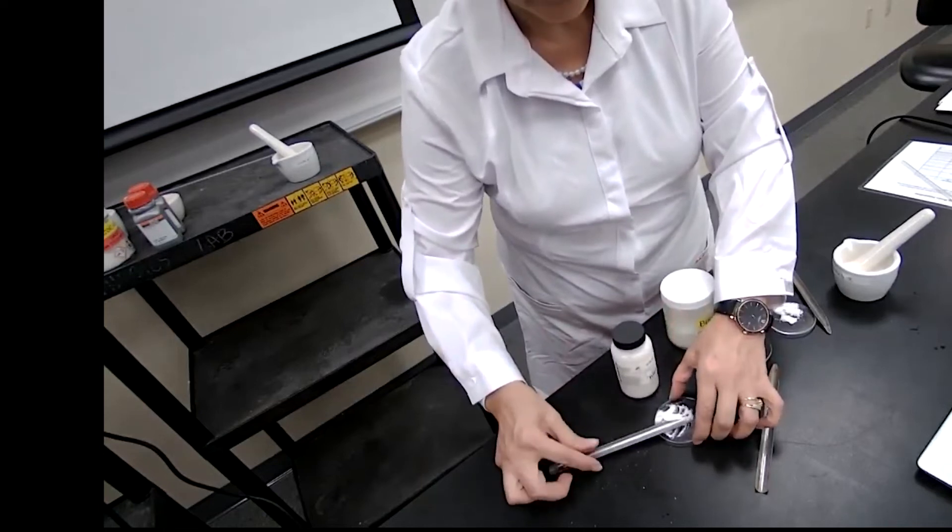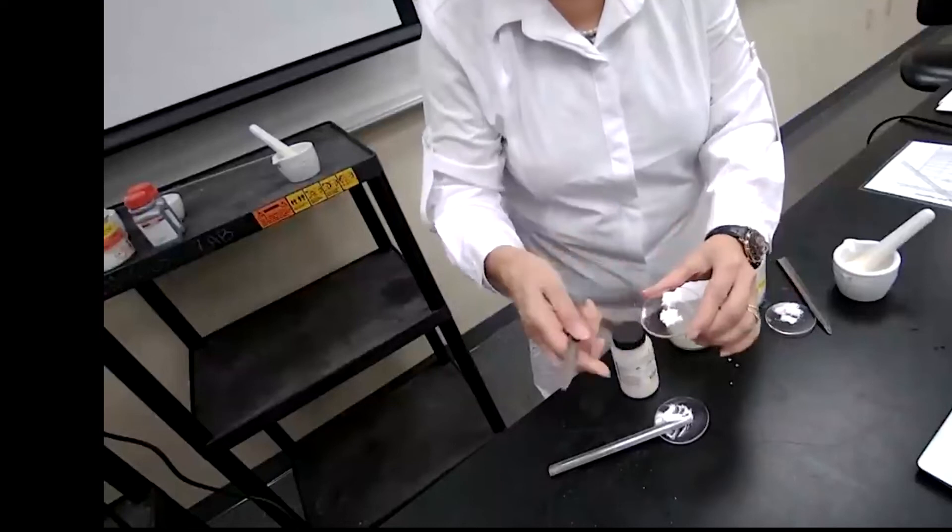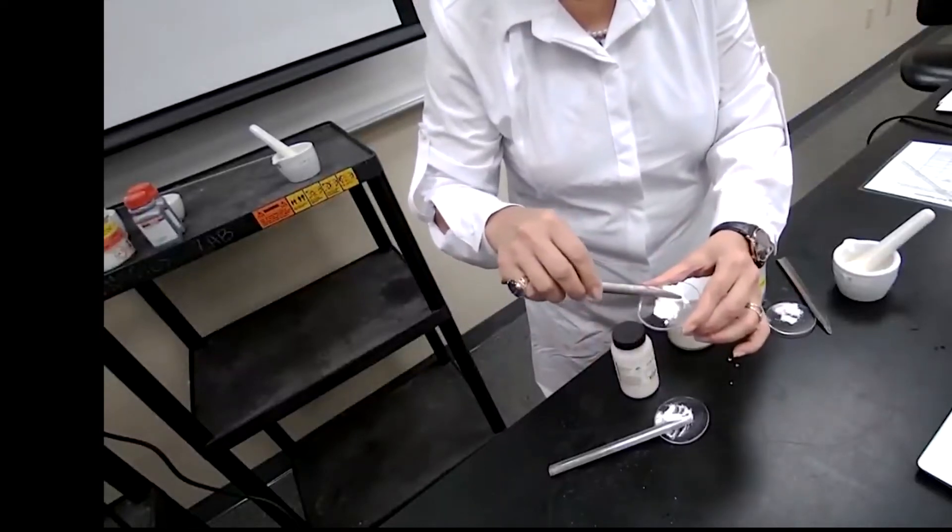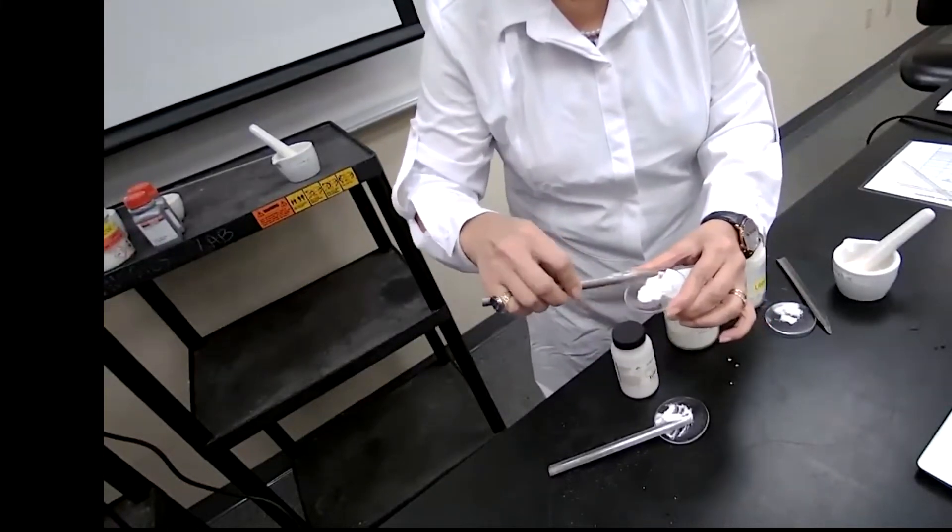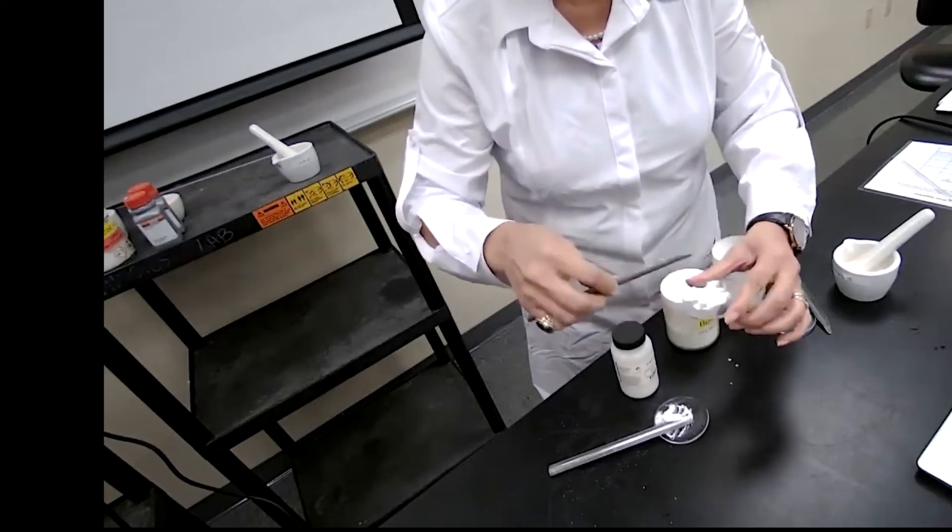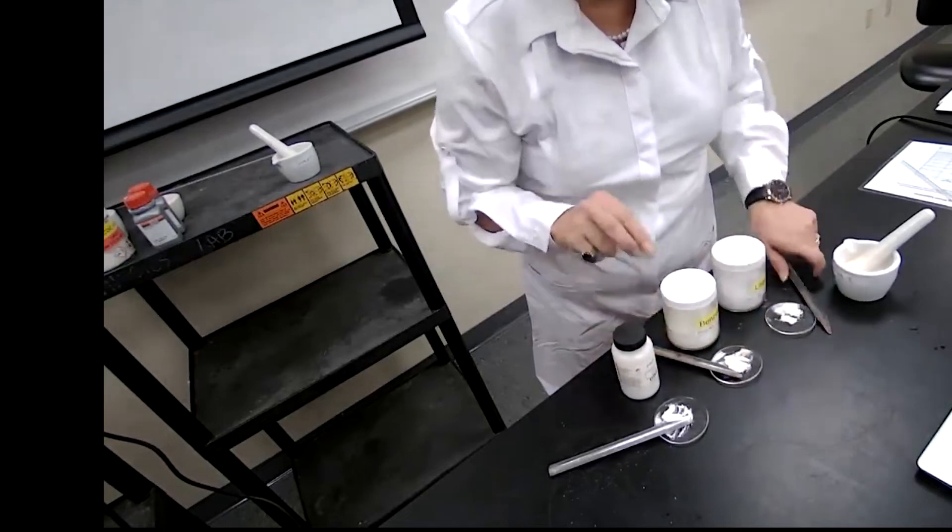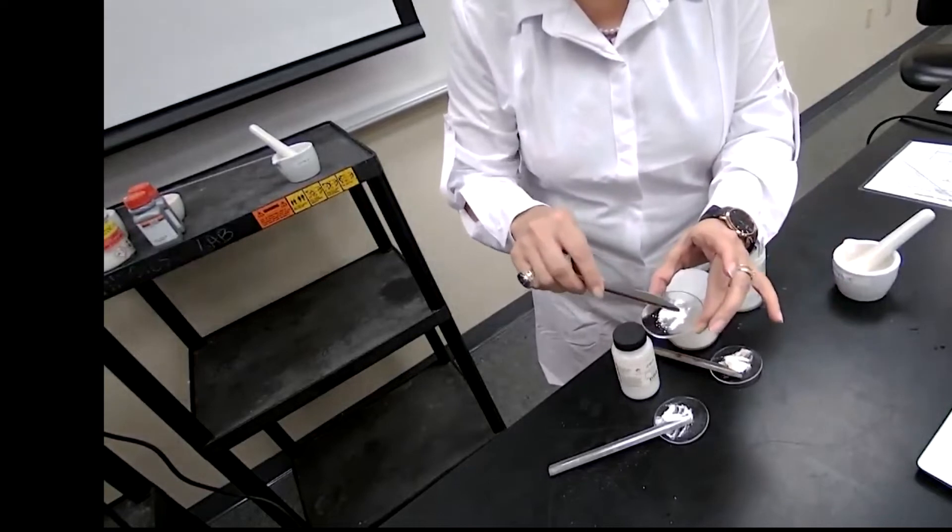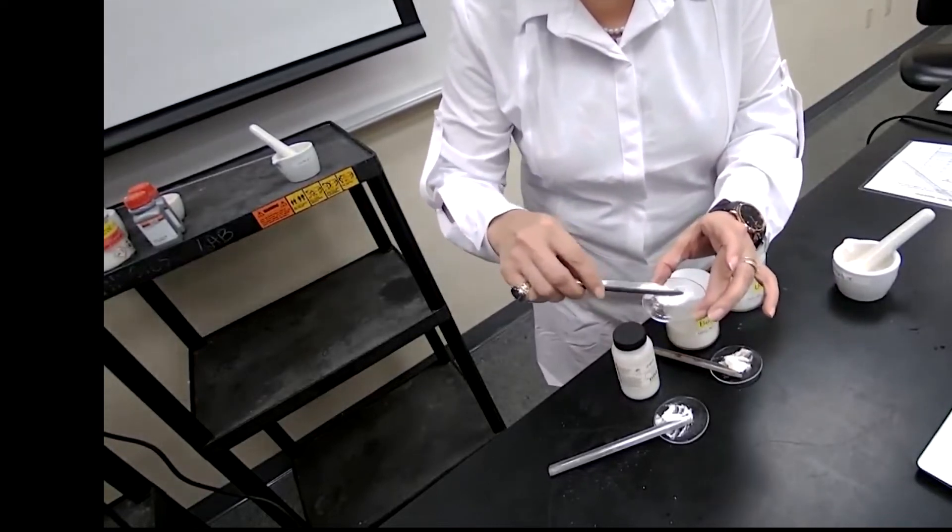I have the sample unknown sample to mixed with benzoin. I'm going to mix it well to make sure that it's homogenous fine or even mixing, completely mixed. Then I have my sample unknown sample with urea. So I have the three samples prepared.